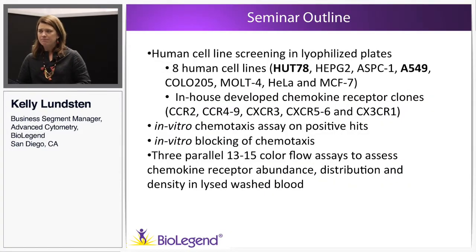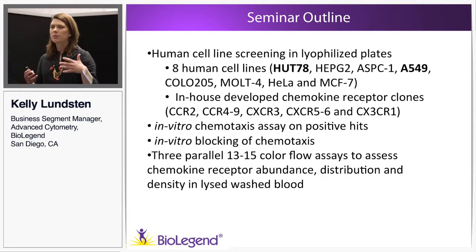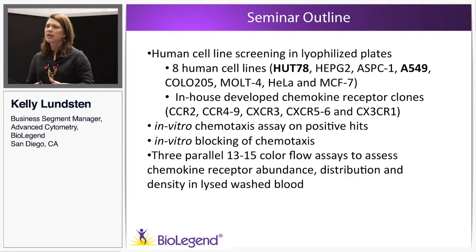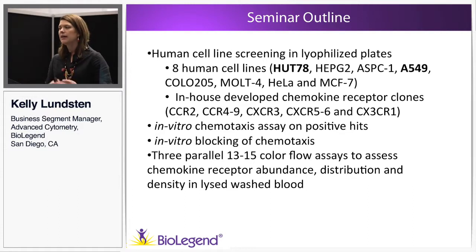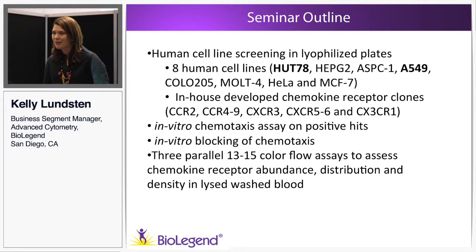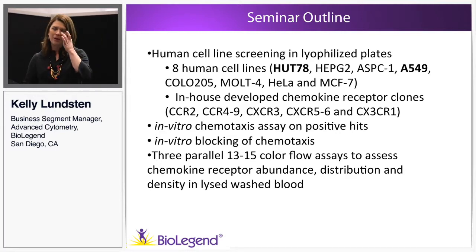What I'm going to talk about today, you can break down topic-wise into two sections. First, as we develop new clones, there is the possibility that they're going to have utility, obviously, outside of the main area of flow cytometry. So we're trying to make a more concerted effort to test them for things like imaging applications, microscopy, maybe IHC, but also for their functional activity. Especially for chemotaxis, it can be extremely valuable to know whether or not you can block that chemotaxis. It's very relevant for cancer and many other things.